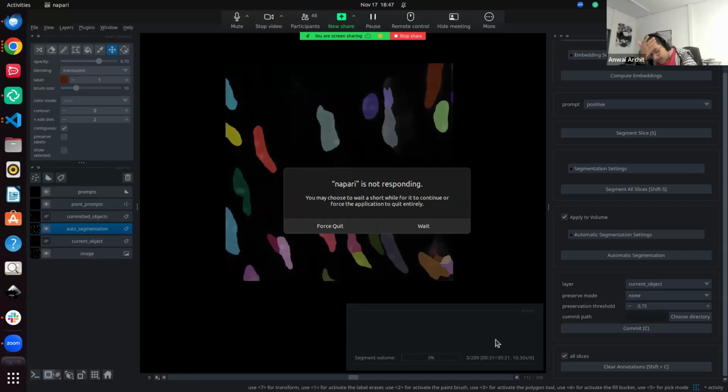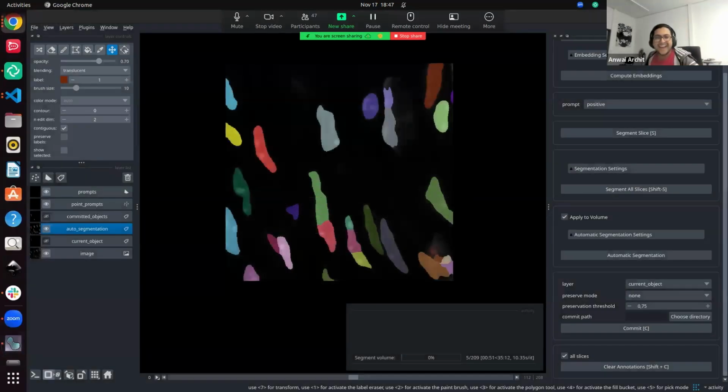Yeah. So we have tried the paradigm of parameter efficient and resource efficient fine tuning in its entirety, actually. In a nutshell, I go back to the first question. We have a follow-up work, I can also send this in the chat, actually. Good promotion. It is basically on resource efficient fine tuning, wherein, let's say, we develop this software, it's going to take 30 minutes. Wow, we are not doing this.